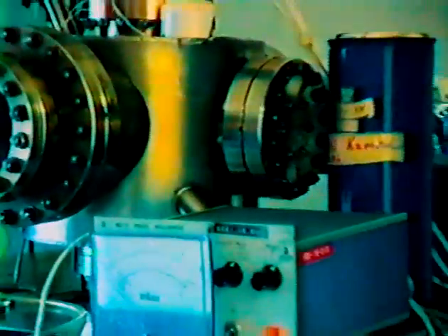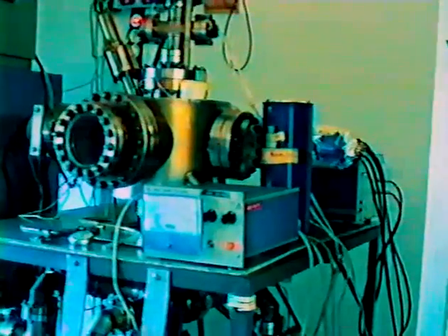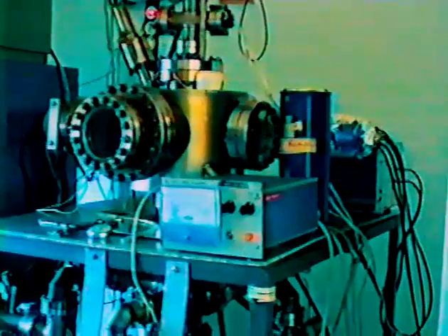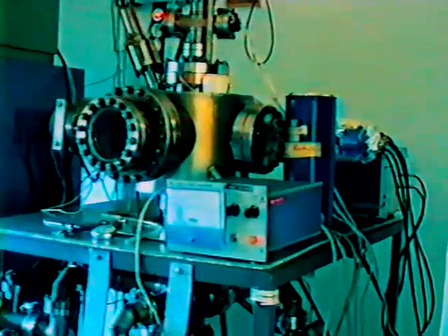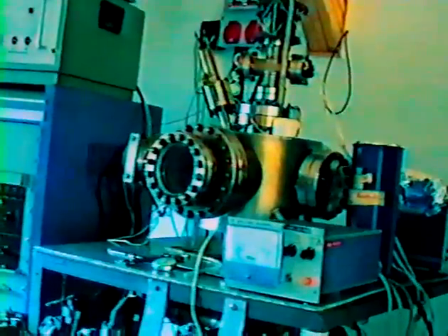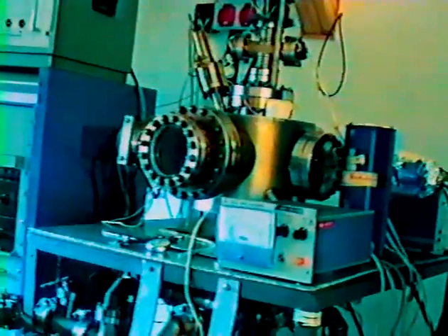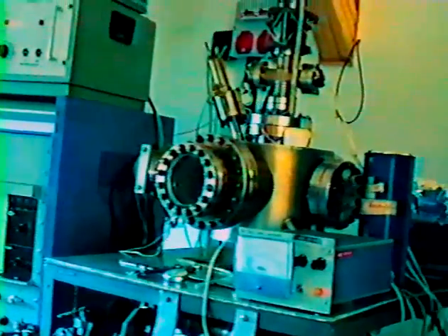Right now my colleague Imre Kovács is investigating here the adsorption of ethyl chloride on palladium. As you have seen during this symposium, we are busy with this topic, I mean the catalytic destruction or decomposition of halogenated hydrocarbons, and that's why a deeper insight into this process would be of great help in interpreting these data. The first step is what happens on the surface of single crystals like palladium. So that's why he's investigating right now the ethyl chloride adsorption on a palladium single crystal surface. So shall we go further?